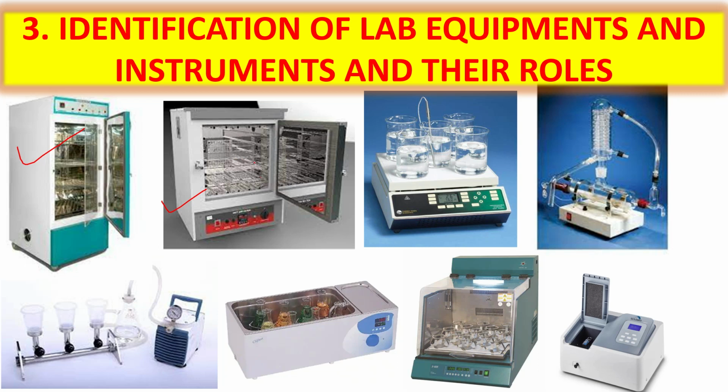Okay, so by this technique we can sterilize the glasswares in lab. Next thing is the hot plate. So hot plate is used for solutions we have to heat to boil. So for that reason we use hot plate. Next is the water distillation unit to produce distilled water, which is used in any type of biological lab.